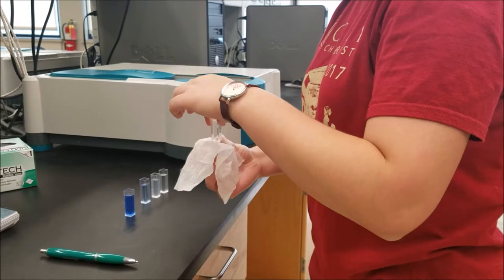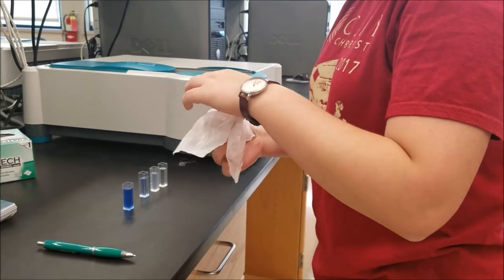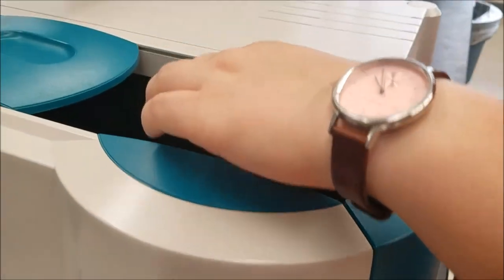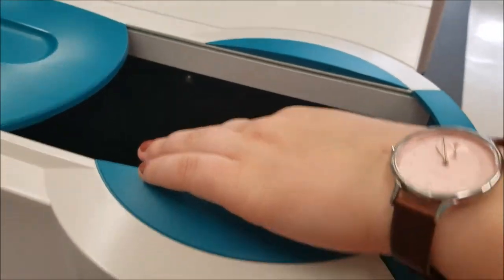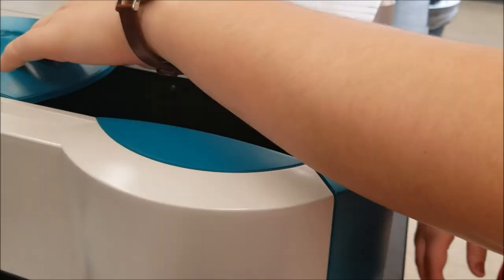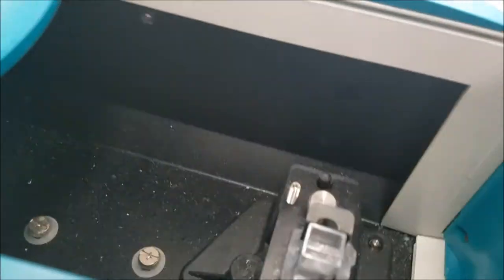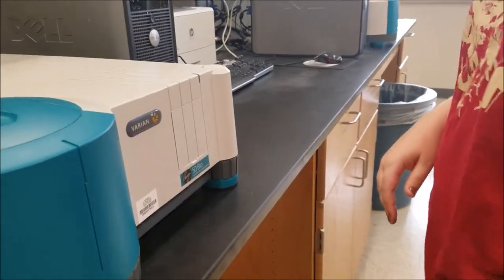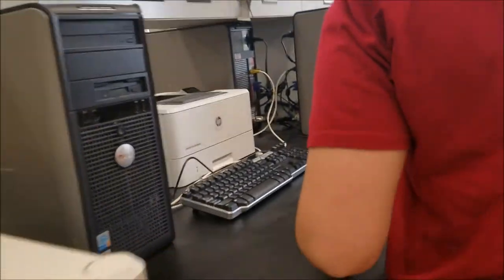When using the spectrophotometer, you must first zero the blank, in this case distilled water. You will clean two sides of the cuvette and place the two clean sides in the spectrophotometer on the side where the light shines through. Next, press zero on the computer. This step is necessary because it negates the water in each dilution, thereby allowing for an accurate reading of absorbance.